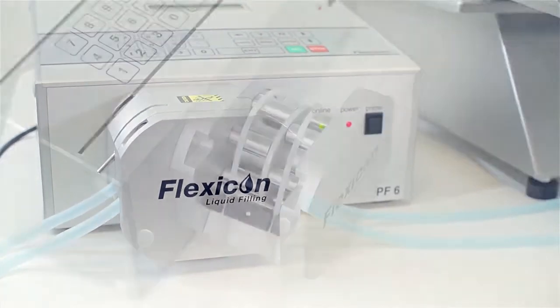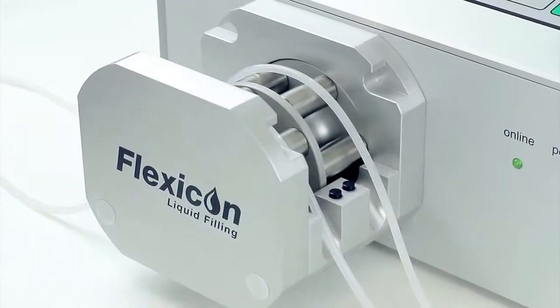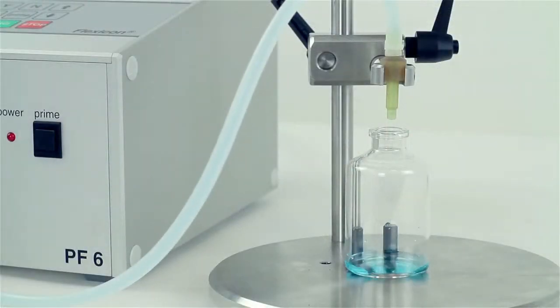The peristaltic filling principle delivers widely recognized advantages of accurate filling, sterility, guarantee against cross-contamination, and ease of cleaning.